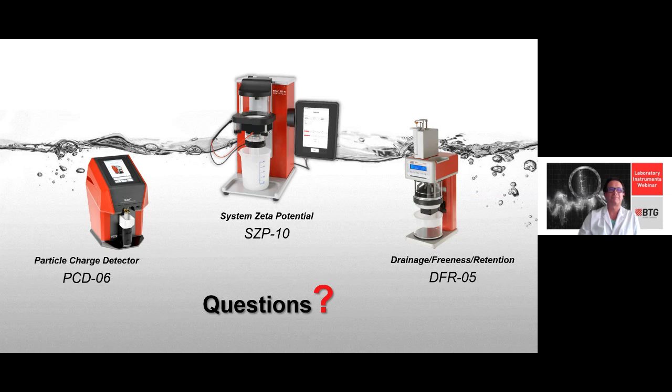Yeah, so Peter, I guess in a nutshell, what I would say is, as long as the titrant and the material being used is prepared properly and cleaned properly afterwards, that is something that the device will do, it will look for that settled point in the middle.